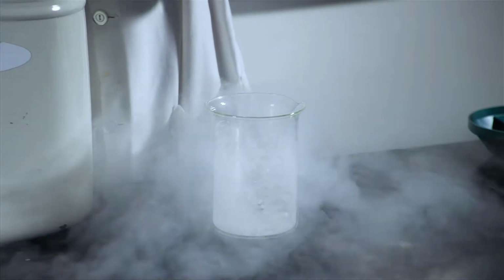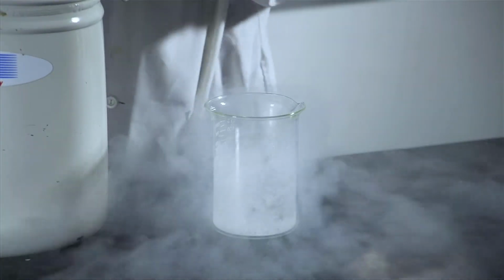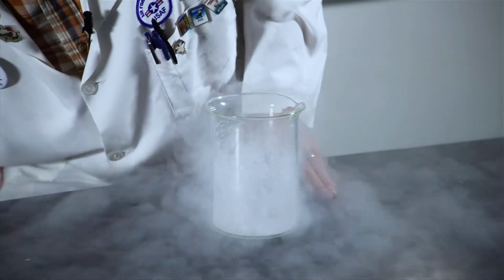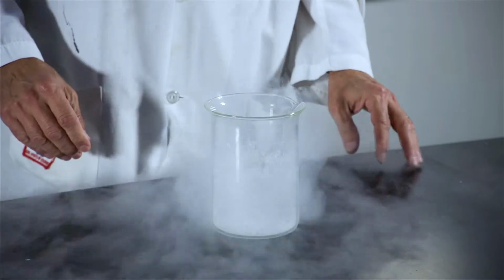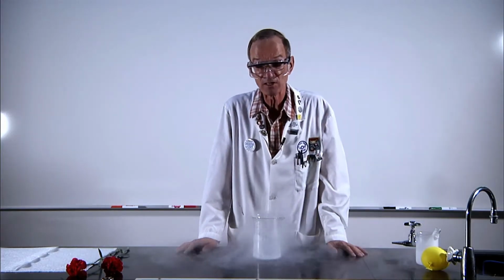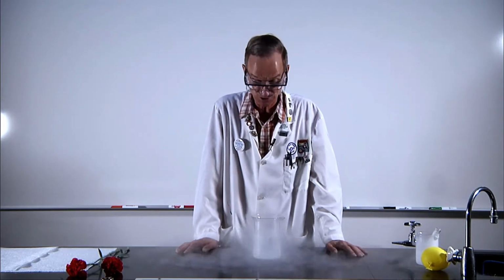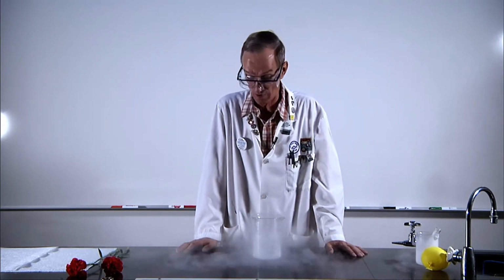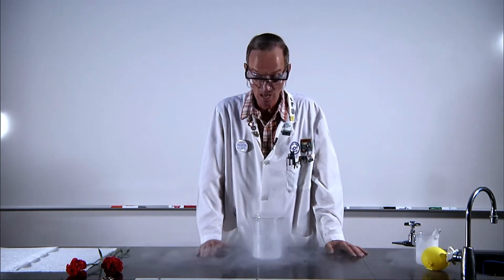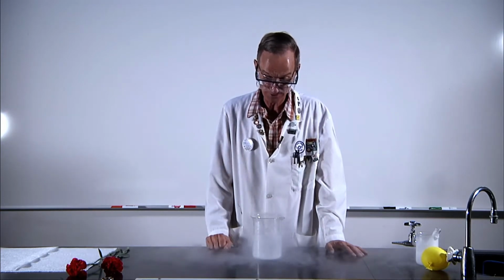And very often when we ask someone what it appears to be doing, they'll say it's really bubbling a lot. But somewhere along the line, somebody will realize, gee, it actually looks like boiling water, like on your stove at home. And that's because it is boiling. Since liquefaction temperature is minus 320 Fahrenheit or around minus 200 Celsius, that's its boiling point as well. The tabletop here is about 70 degrees above 0 Fahrenheit, more than hot enough to boil it, which is exactly what we're seeing right there.